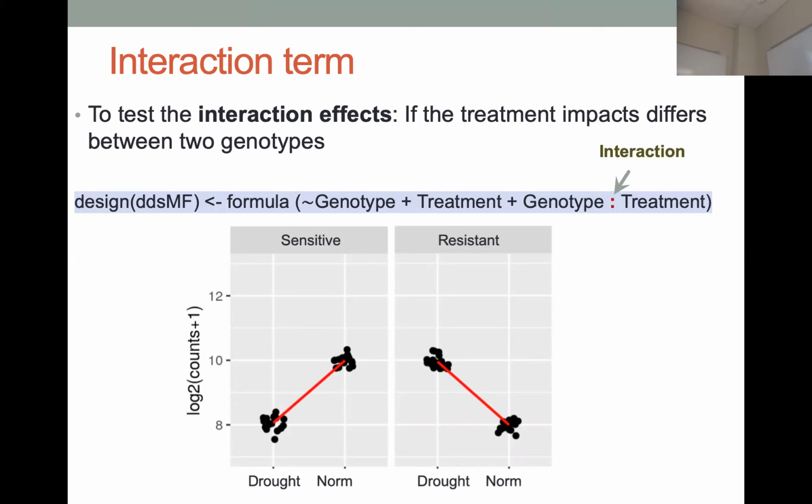Maybe I should use this line, just these two clusters of the samples. Yeah, it's kind of misleading. Yes.